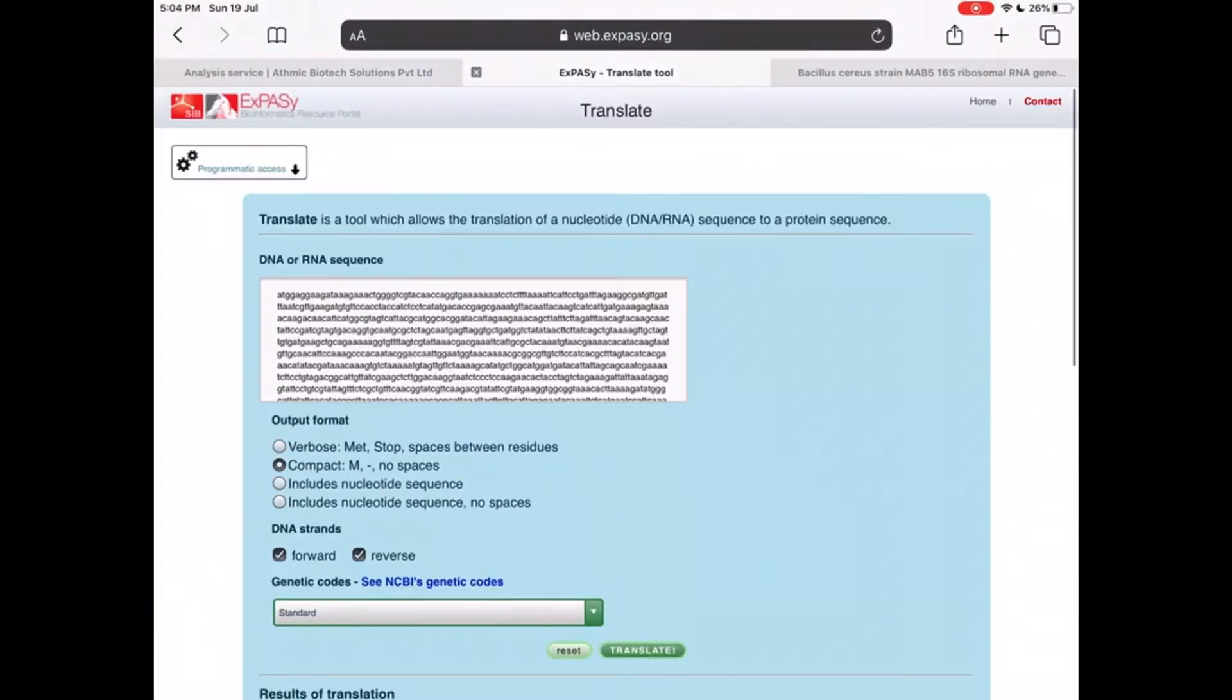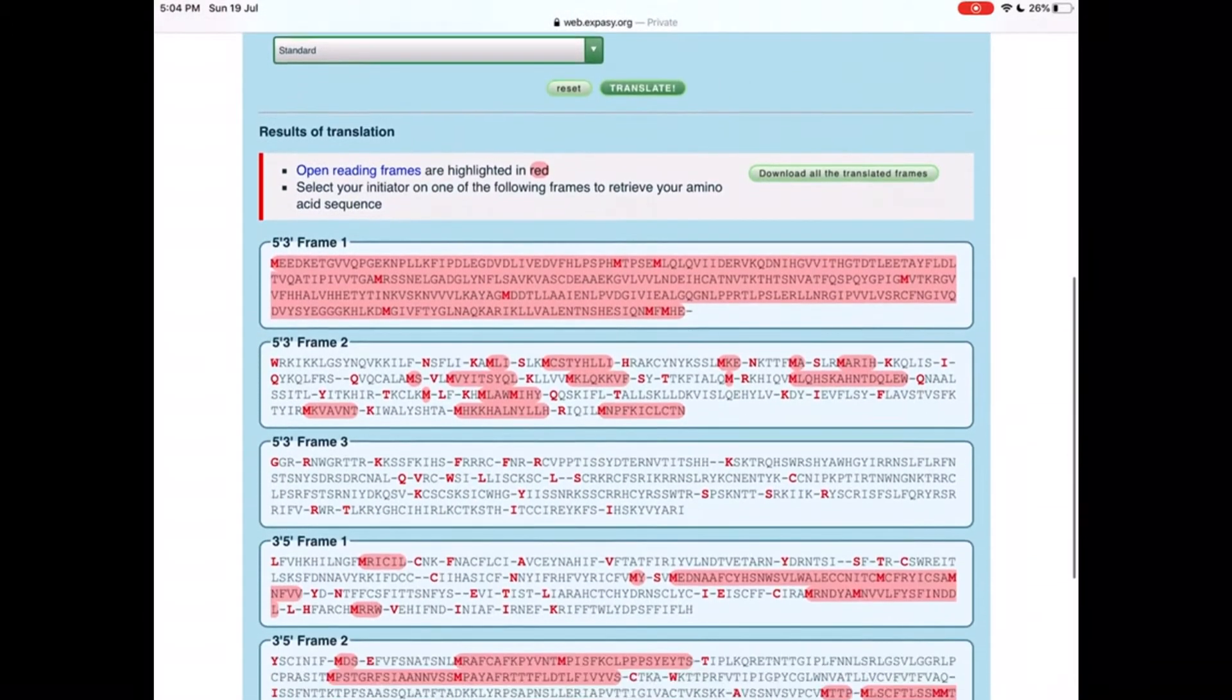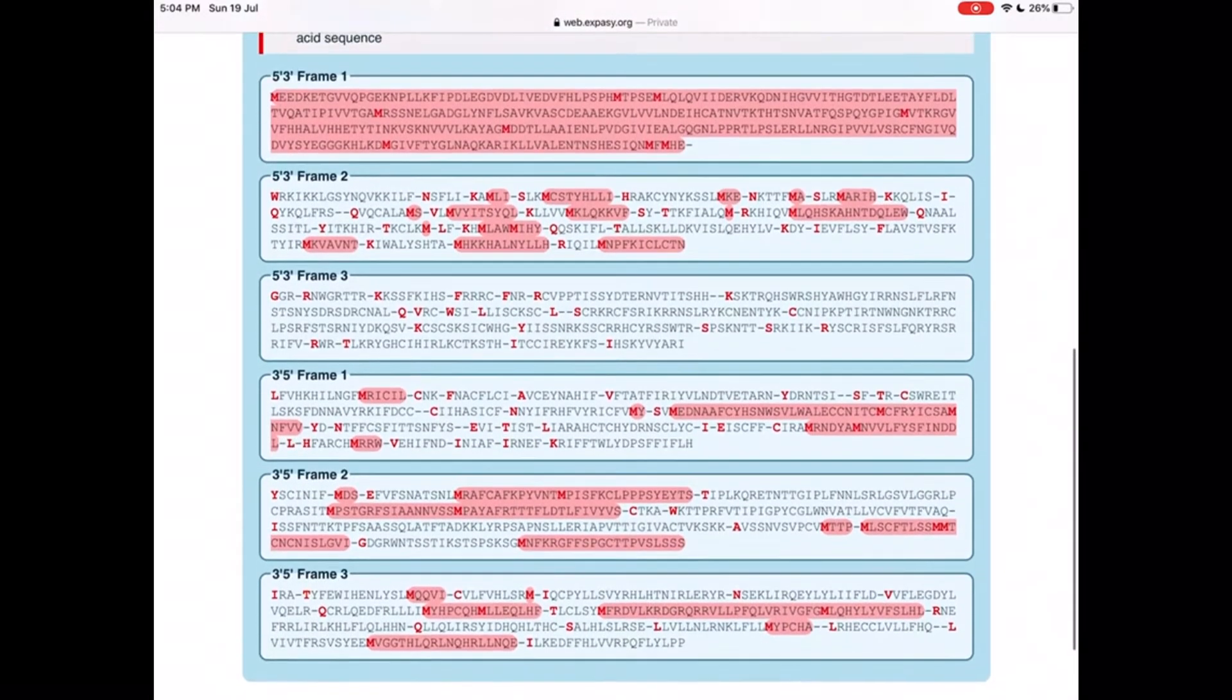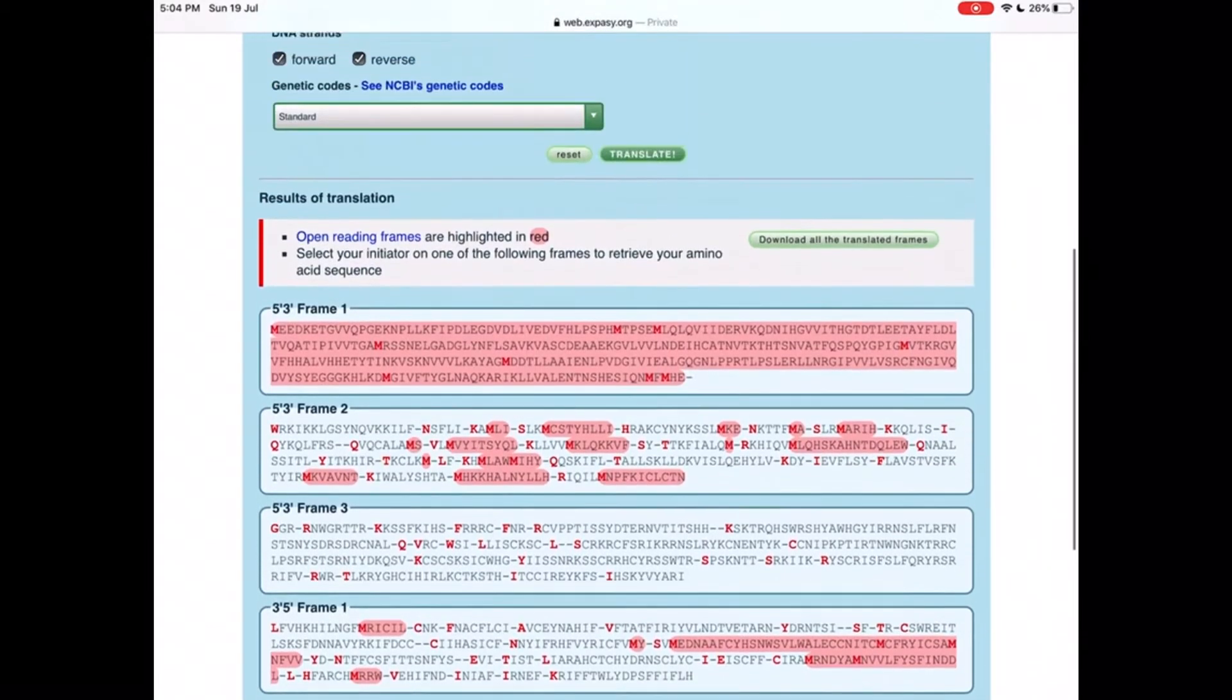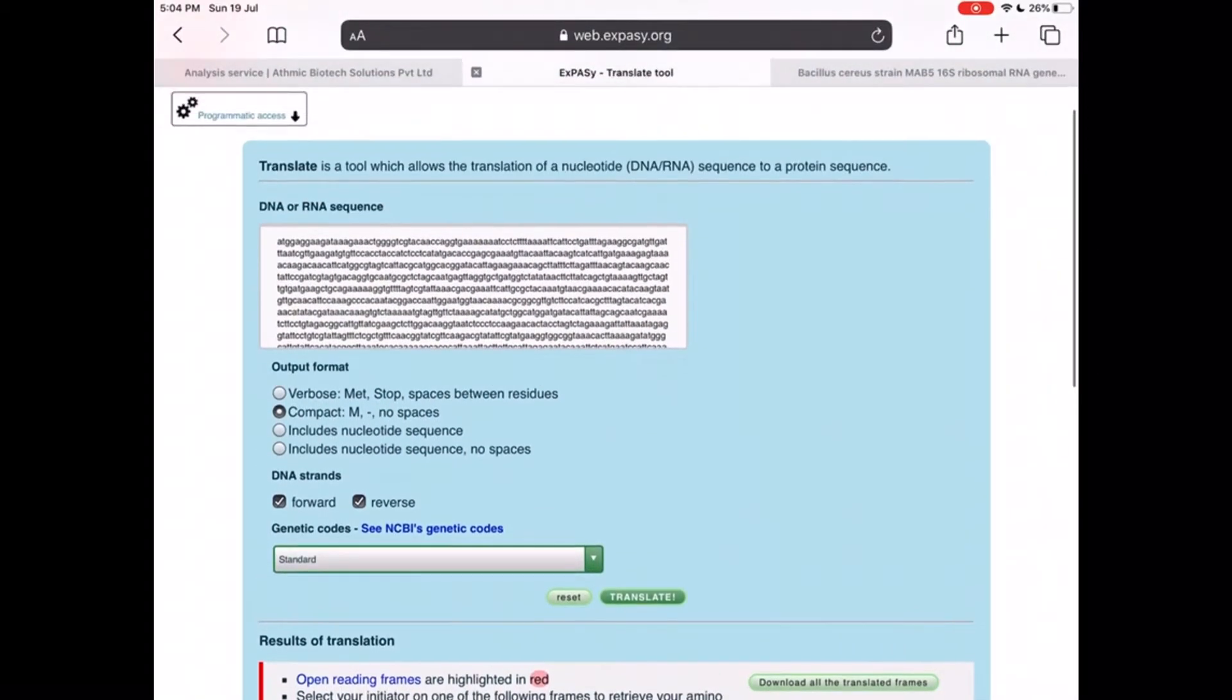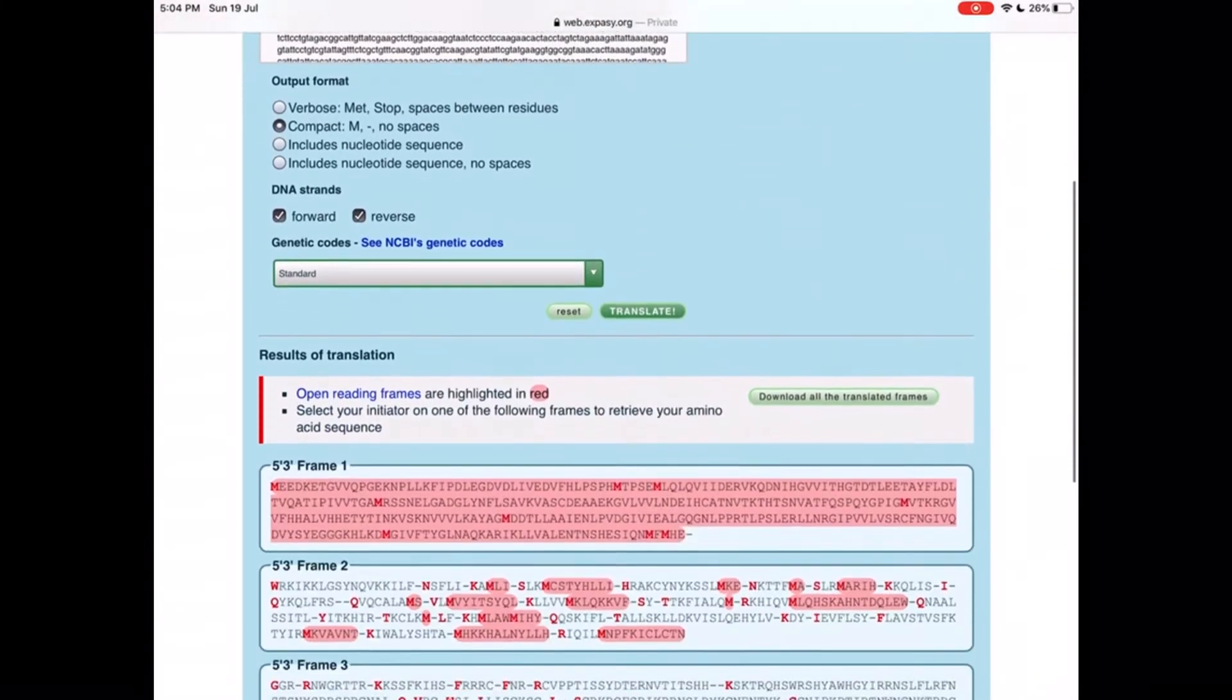See, the nucleotide sequence is translated into corresponding amino acid. You can see all the reading frames have analyzed, six reading frames.